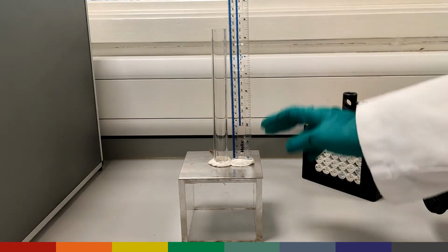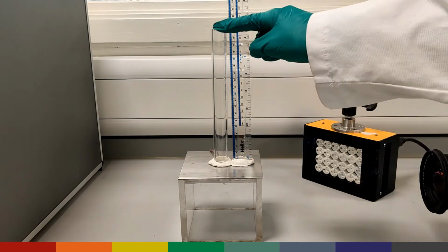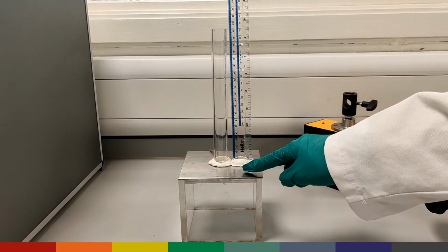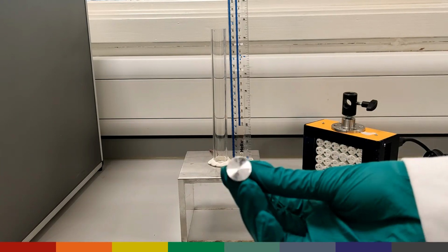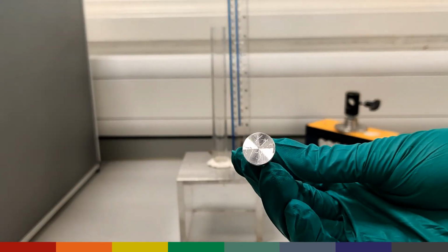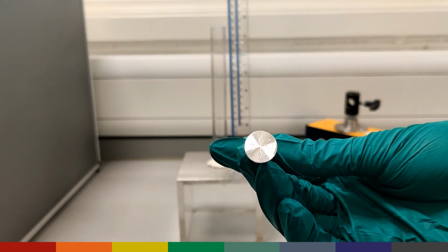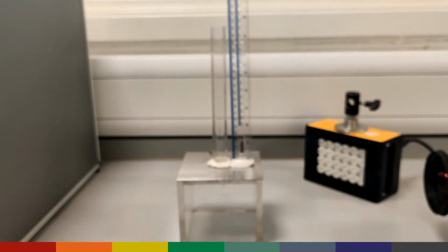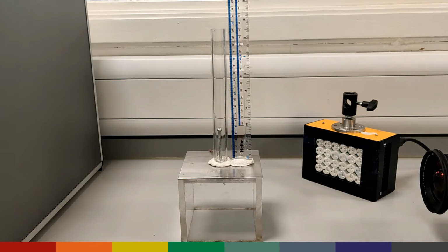The next thing we have is a test rig just like this. It's got a ruler, a hollow tube, and a base with a hole right at the center. What we have next is an SEM sample stub. And we are going to drop the SEM stub right into the hollow tube. Just like this. But of course, we are not just going to drop the SEM stub. We're going to drop something else alongside with it.